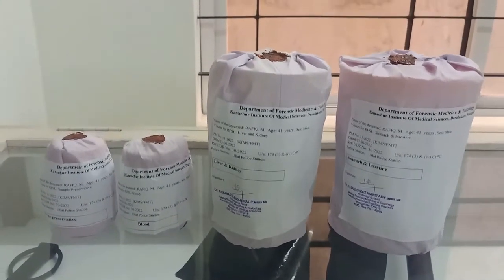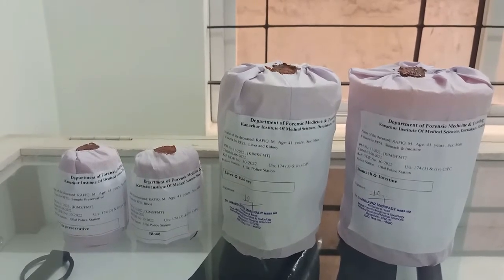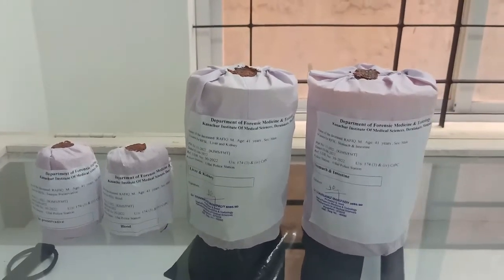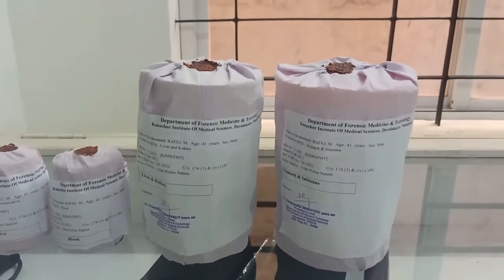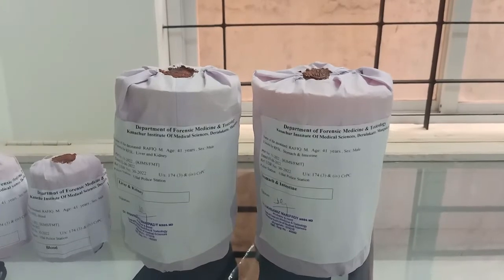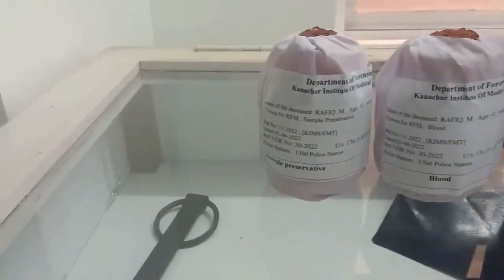At the end, this is how the four routine bottles which are sent to the forensic science laboratory look like. From right to left are the labels on bottles number one, number two, number three, and number four.